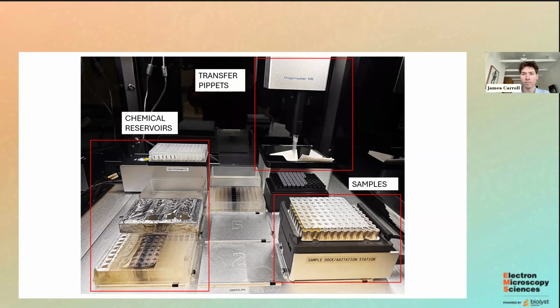So the uranyl acetate, no, I just have a waste bottle. Osmium tetroxide, I put in corn oil. And we have a whole department here that handles the chemical waste, so they handle disposing of all of it. What they do with it, I do not know.